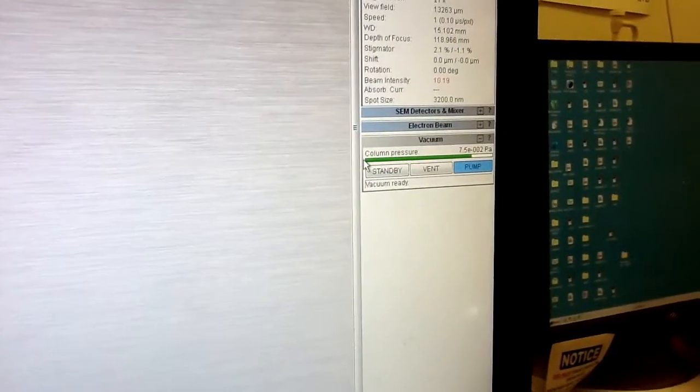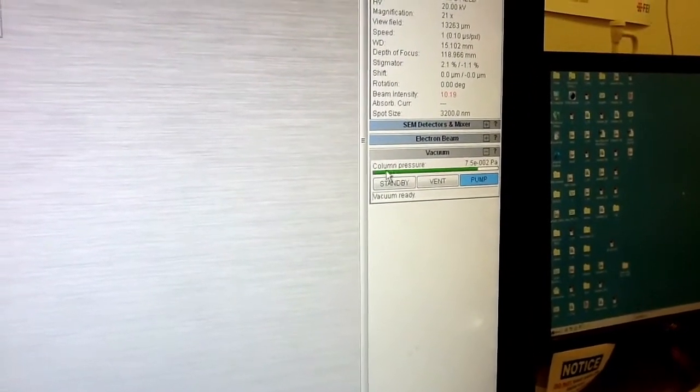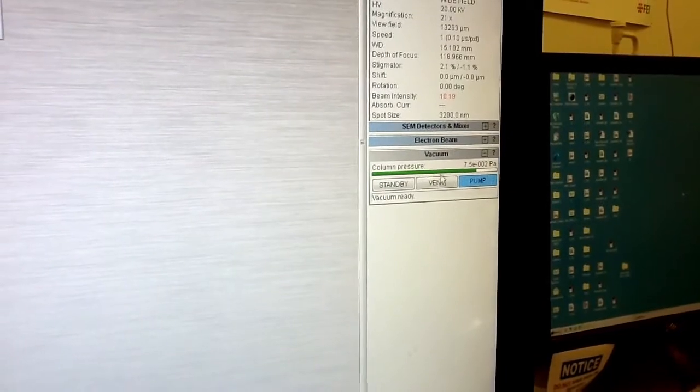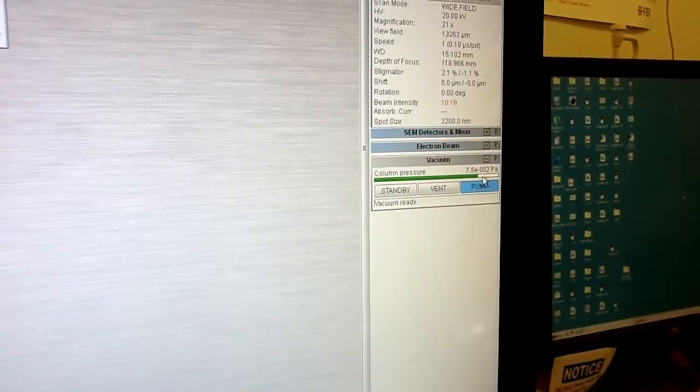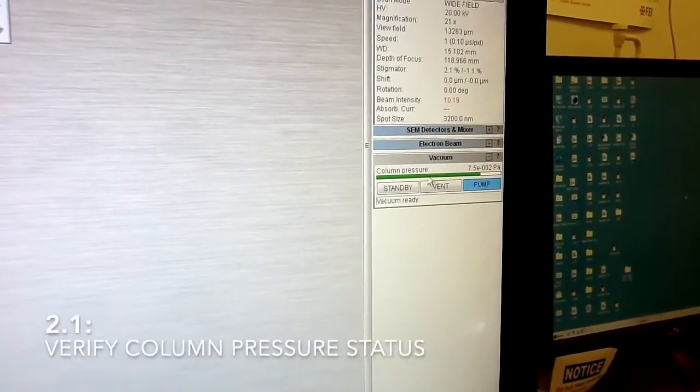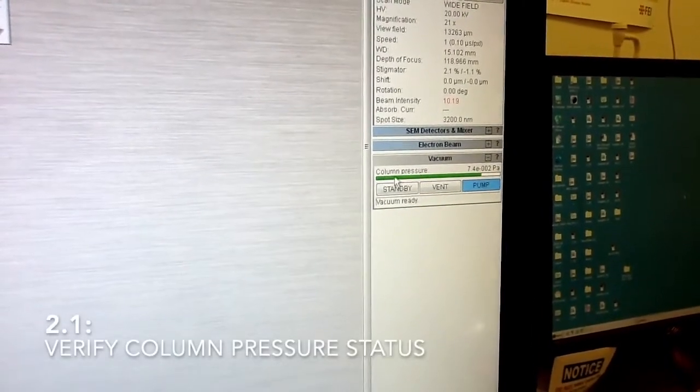In the software you should see first that the column is under vacuum, which means you will see this green bar here.